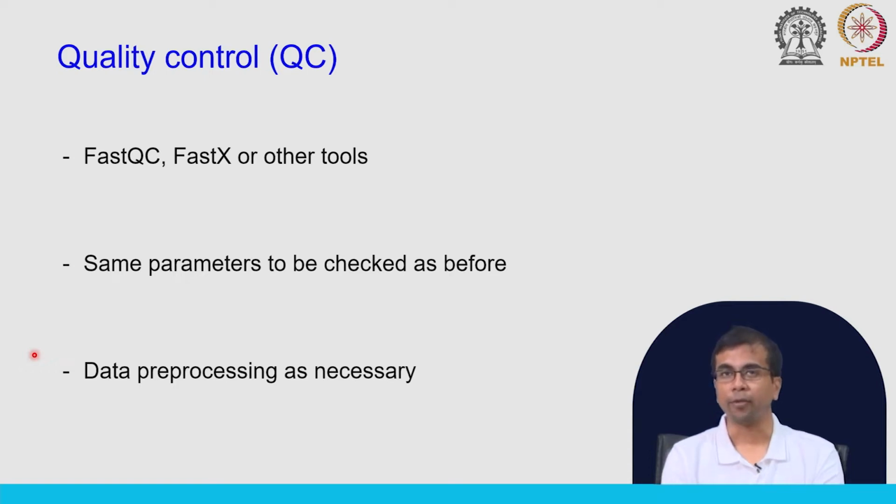So, what I am going to do is discuss read mapping. Why is this a problem here, what is new here? We have talked about read mapping, we have talked about the tool Bowtie2, and we have utilized that tool for read mapping in a small data set. If you remember, Bowtie2 relies on Burrows-Wheeler transformation, is very efficient, and does not take too much memory. So, what is the problem? Why can't we just use Bowtie2 here?